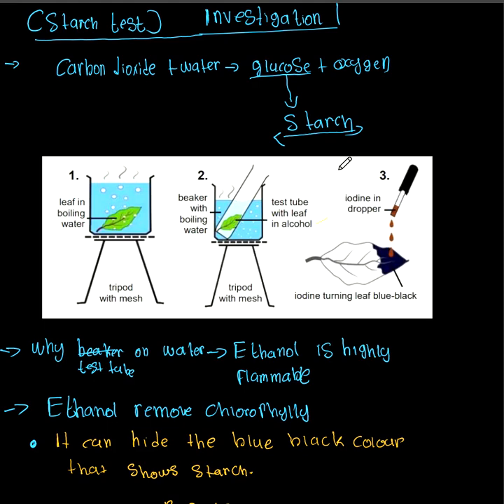So at investigation number 1, we're going to look at what we call a starch test. All our experiments that will follow will be based on the starch test.